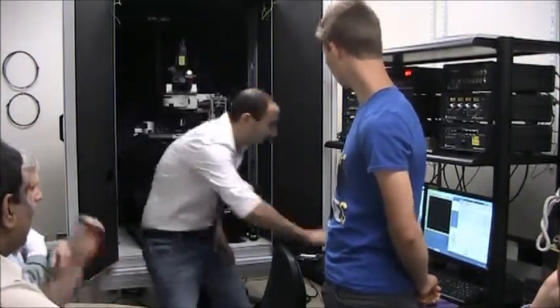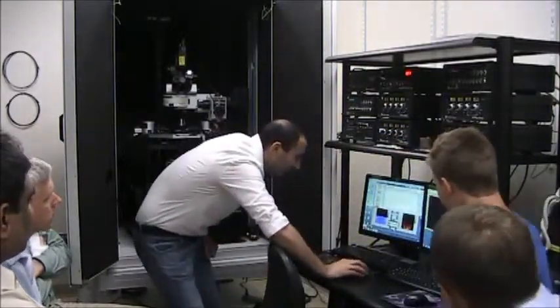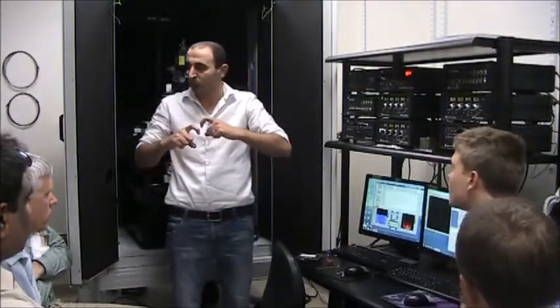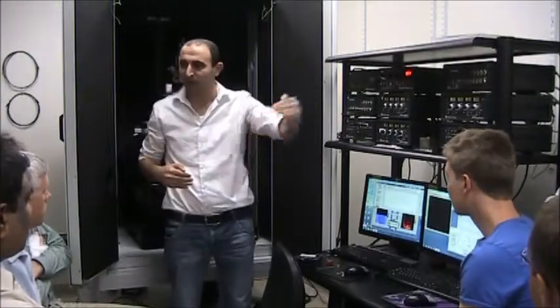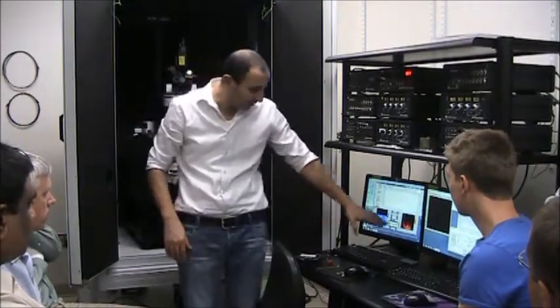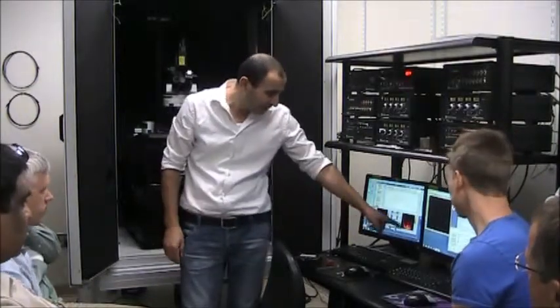In fact, I think we still have one picture like that. Yeah. So this was the AFM, and this was the NSOM image on top of a dual strip. Sorry to shift to the other subject. See these lines here. This is where we were touching with the first tip. So we know this is the zero point, and from there we scan back from the fixed tip, the illumination. So this is an AFM, this is an NSOM. But that's AFM with the NSOM probe. Yes, that is true. It's an NSOM with an AFM probe, and this is the NSOM signal which is detected there.